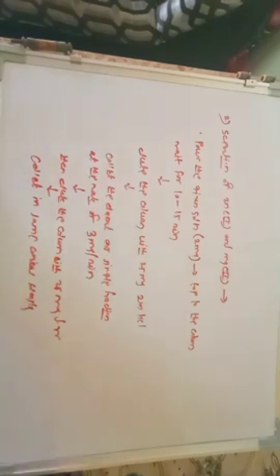So we already discussed that this fraction is magnesium, because magnesium is eluted with hydrochloric acid. So whatever ions are separated, it is your magnesium, Mg(II). Whatever fraction is collected, that is your magnesium.